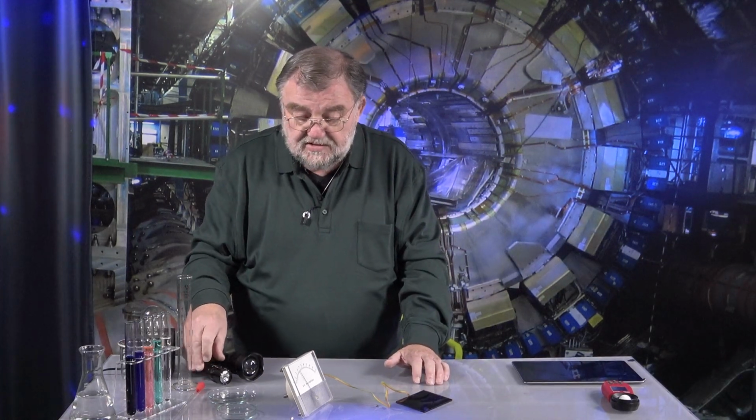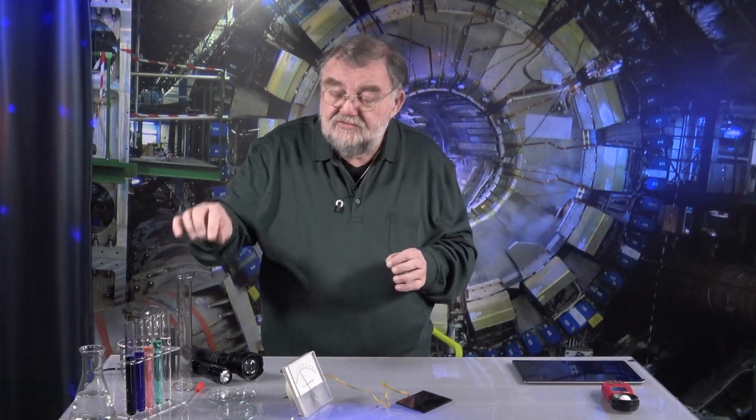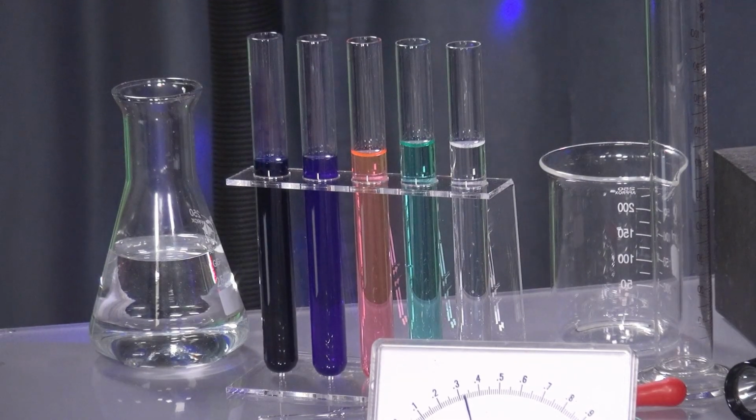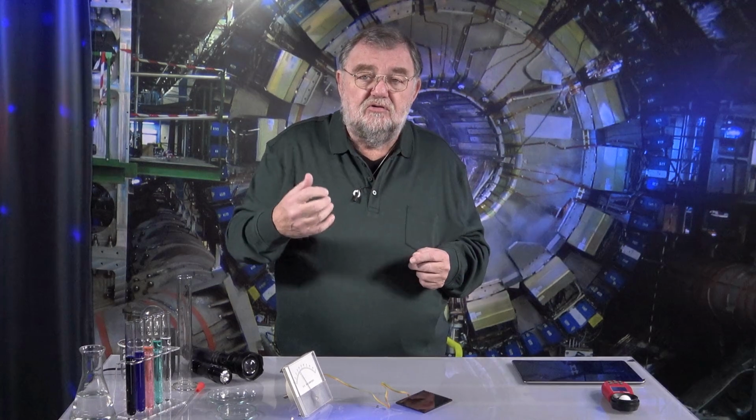So, I think I've done enough to try and explain the related themes. So now we have to think about what we can do with this. We can, for example, investigate and determine the components of fluids when we shine in different wavelengths and see what is absorbed and reflected. And if we calculate it, which is complicated but is what the measuring devices do, then we can say, okay, that is what it looks like.